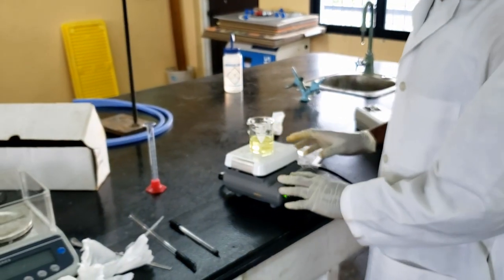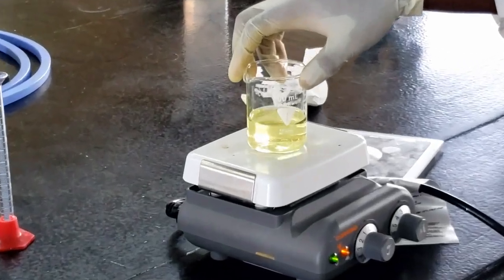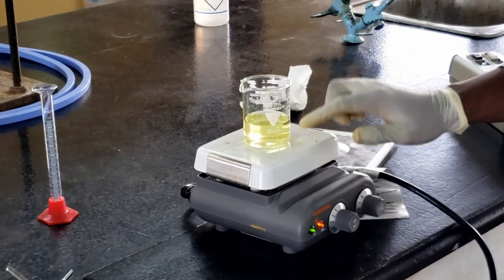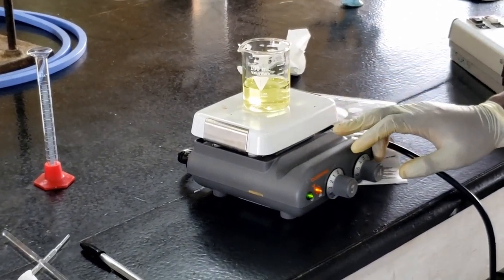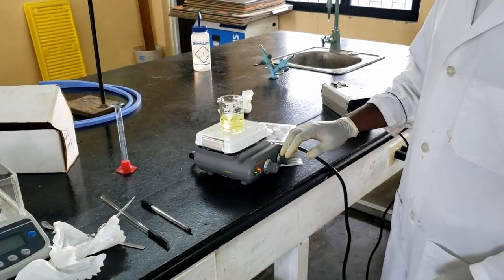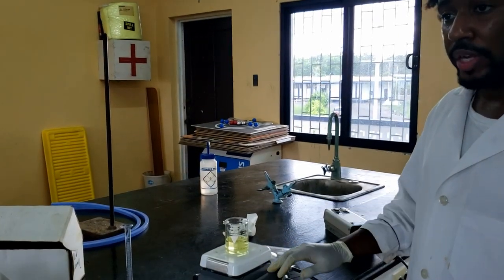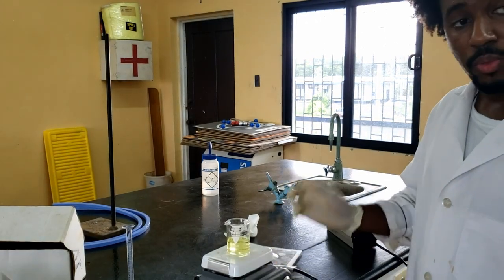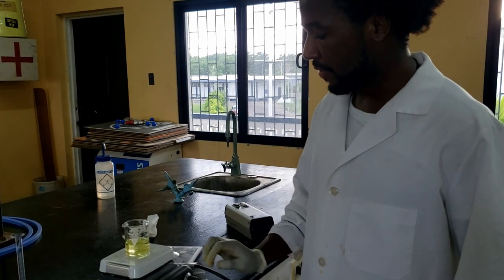The mother liquor from the previous step we have here inside a beaker. We're just going to evaporate this solution down to about 10 mLs of liquid, and after we've evaporated it down, we're going to leave it to cool slowly to room temperature, and we should get a second crop of crystals. So while it's cooling, it should recrystallize some more of the bromonitrobenzene, and then we'll wash again at the vacuum filter.